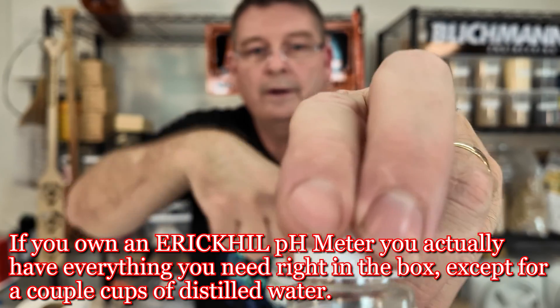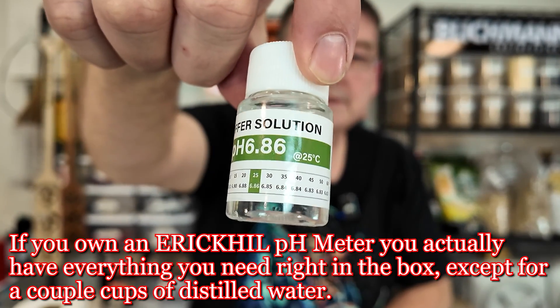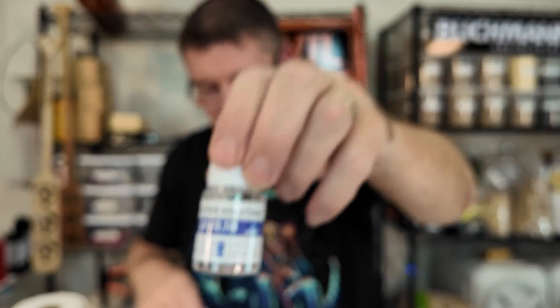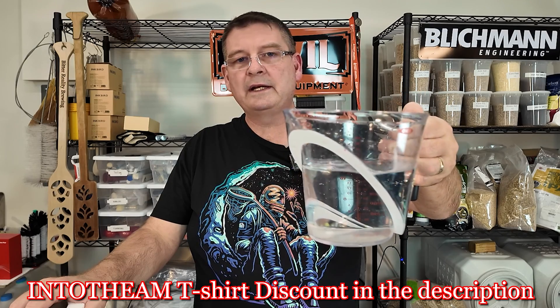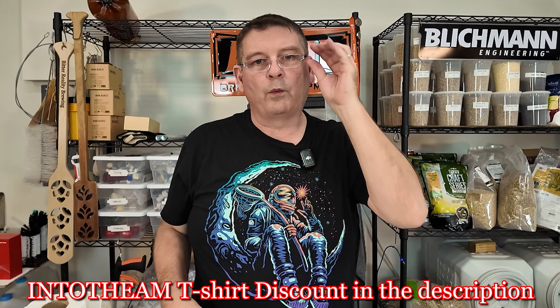Set them side by side. You've got your 4, your 6 — and I think that six is 6.86 — and your 9.18. Put them somewhere that's nice and clean. Get a thing of paper towels. I have about three cups of distilled water.